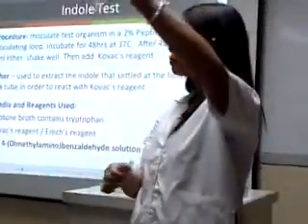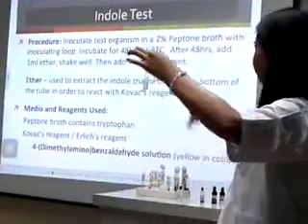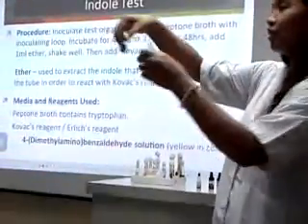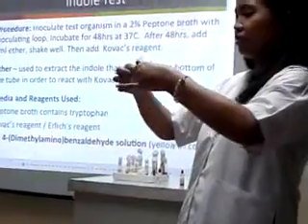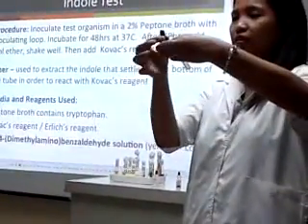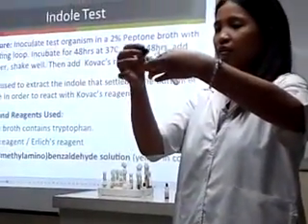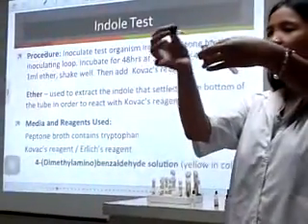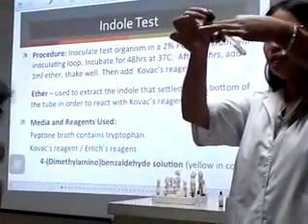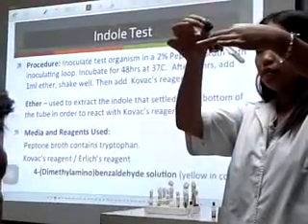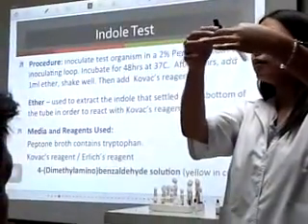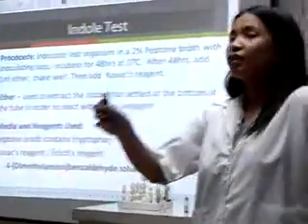And then you add your Kovacs reagent. Kovacs reagent. You add it on the side of the tube.